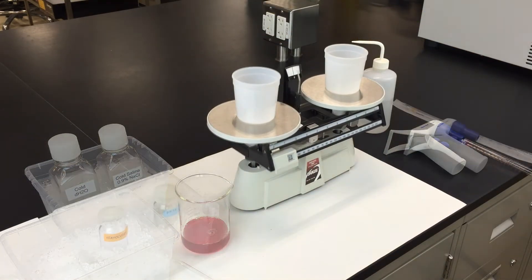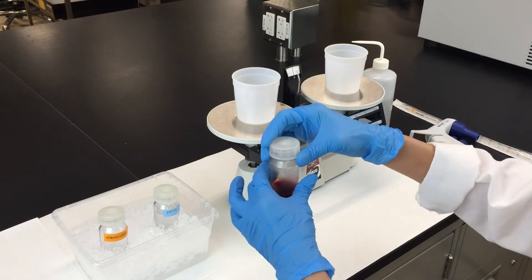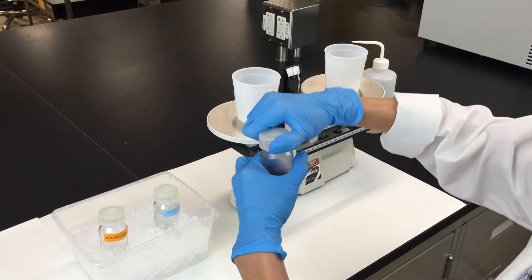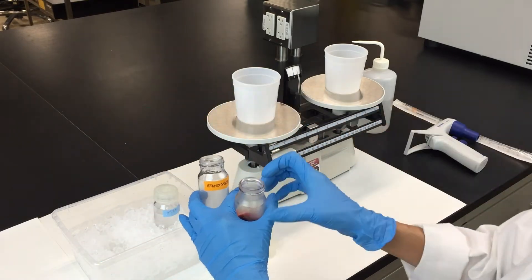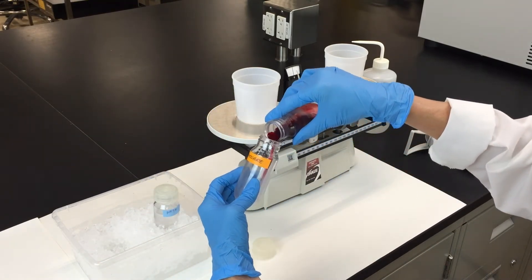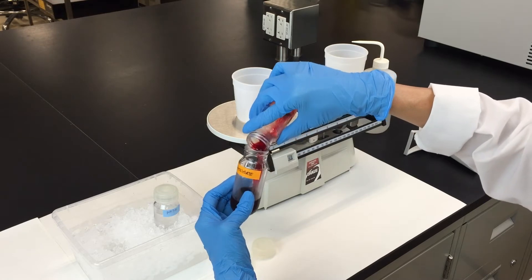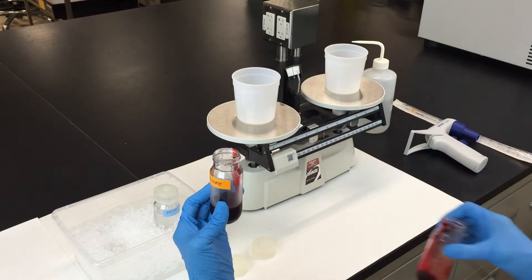After the third spin, pour the liquid layer into a tube labeled hemolysate and discard the pellet. The liquid layer now contains the hemoglobin and the pellet contains the cell debris from the broken red blood cells.